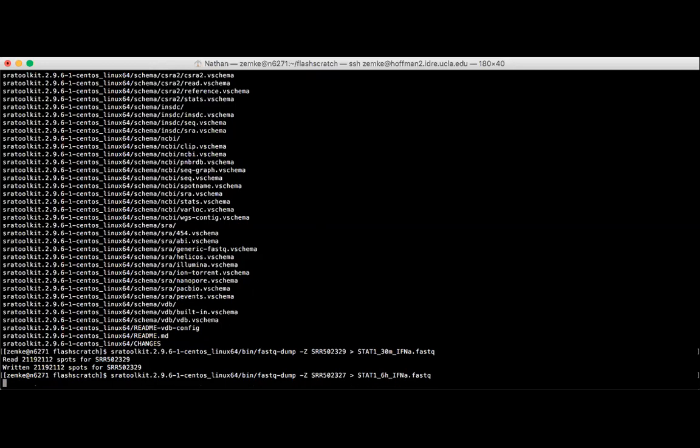And it tells you how many reads were downloaded into the FASTQ file.